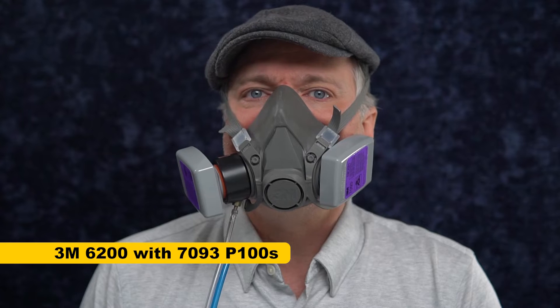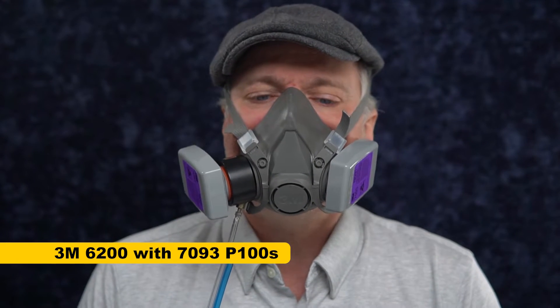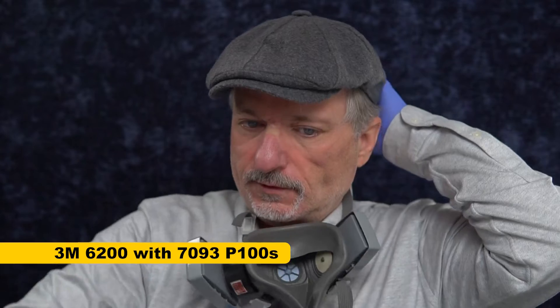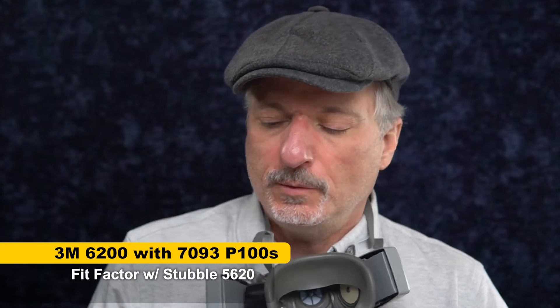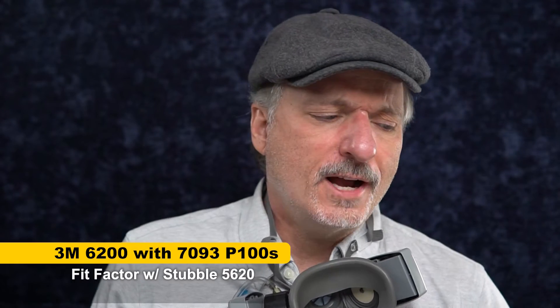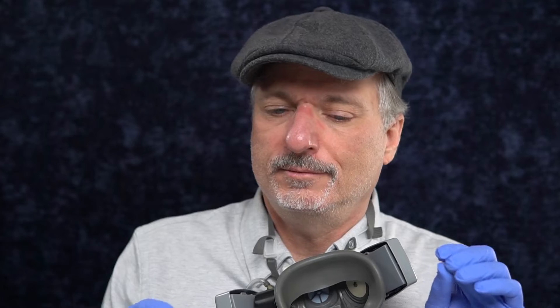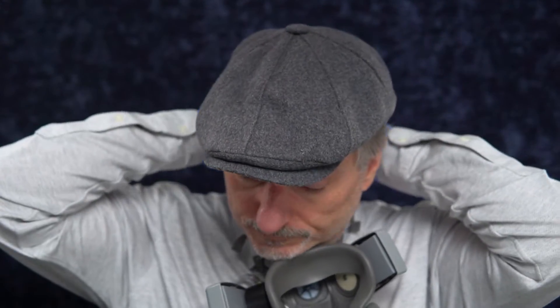With this 3M 6000 series respirator with 7093 P100 cartridges, we're going to give this a fit test with stubble. The overall fit factor is 5,620. That's just how much better an elastomeric mask is with P100s. The fit factor required for one of these masks using the N95 test is 100, and 5,620 is really good — that's with beard stubble and the head straps on pretty tight, on a static test. Don't count on these being the same results while working. Also, I already know this mask fits me well.